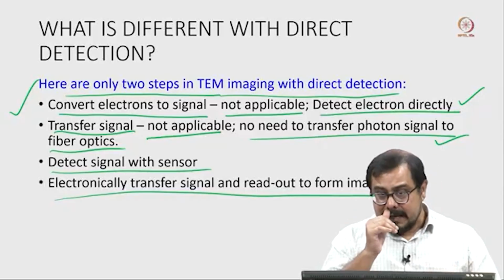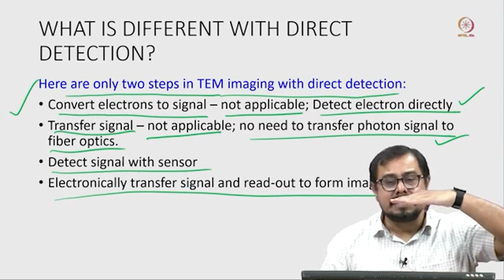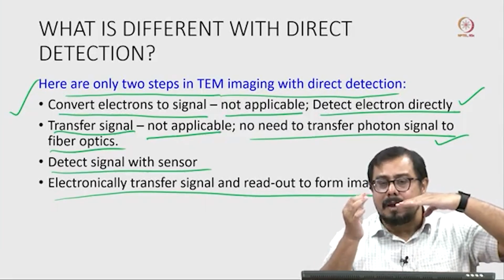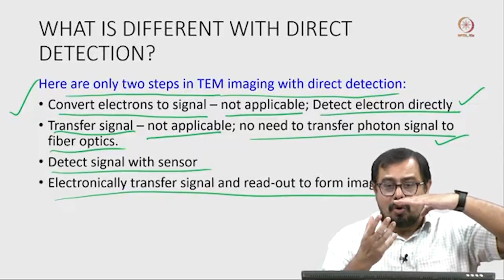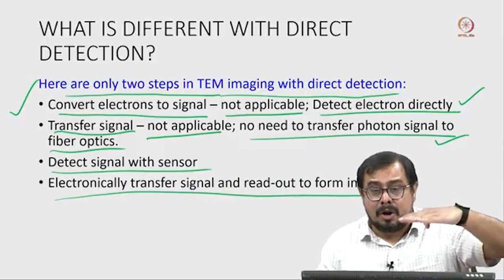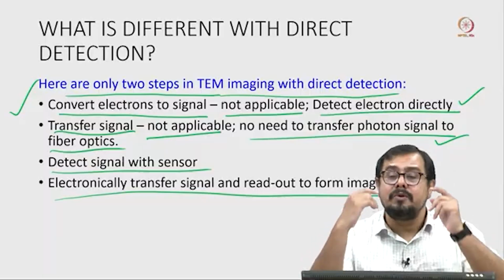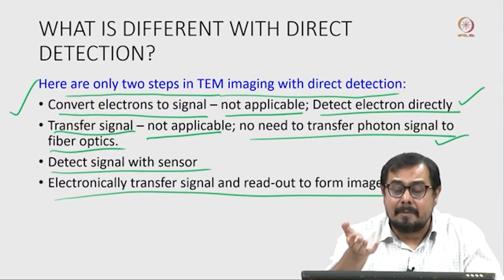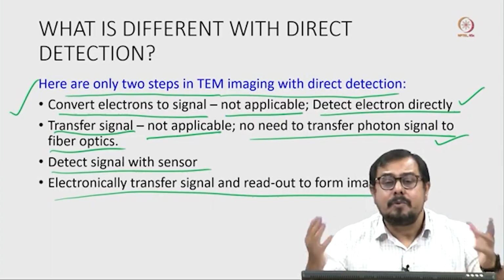That is the time when thermal drift matters. If this is a sample we want to image, and this is even a micrometer, consider that a 0.1 micrometer, 0.2 micrometer movement is there because of the electron, and there is a little bit of drift, 0.1 every second. That drift is also huge when we want to see the side chain of a protein or of an amino acid.